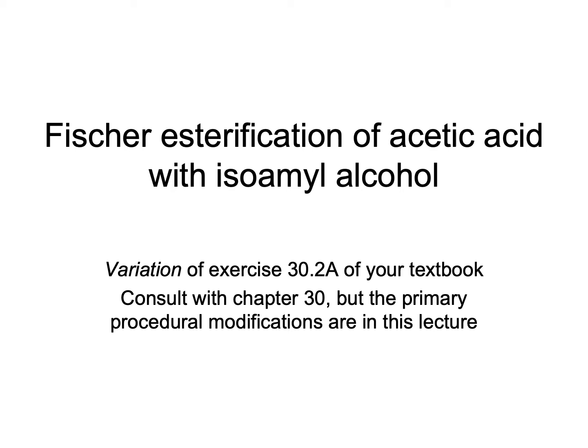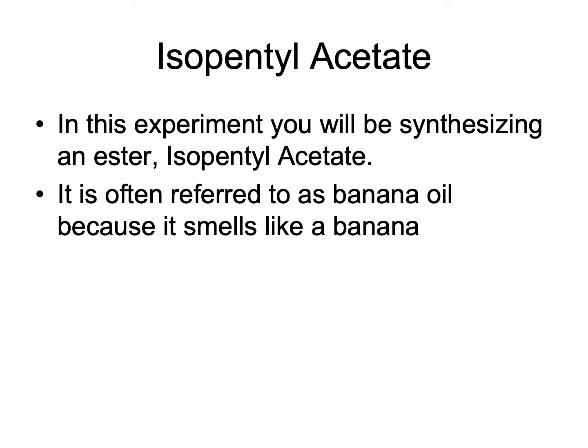Everyone, in this session, we are going to discuss the Fischer esterification of acetic acid with isoamyl alcohol. During this experiment, you will be synthesizing an ester, which is isopentyl acetate. It is often referred to as banana oil because it smells like a banana.